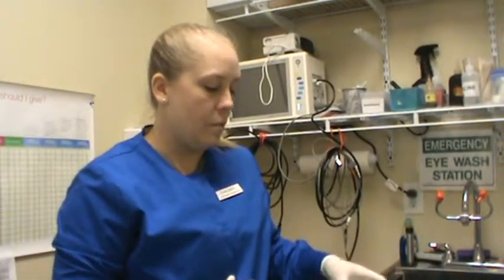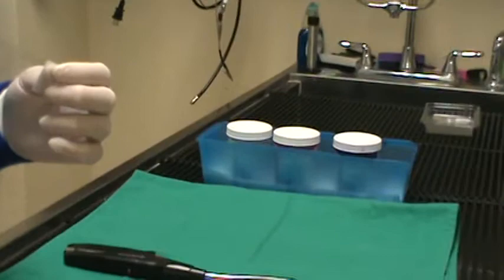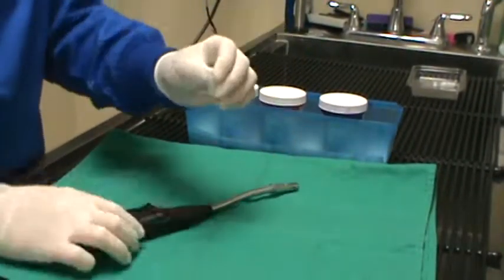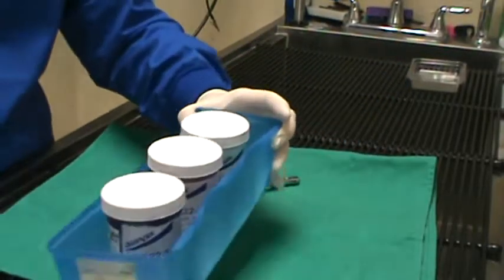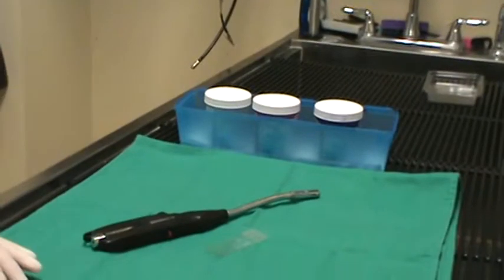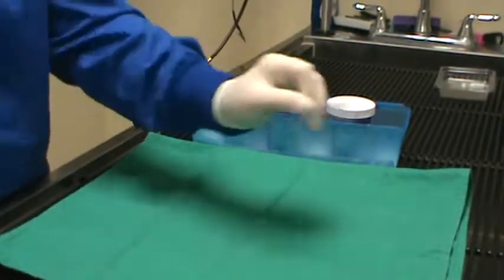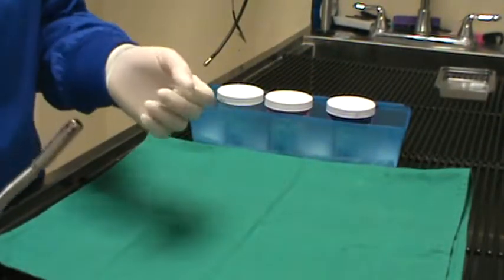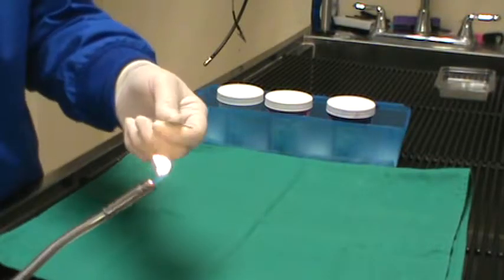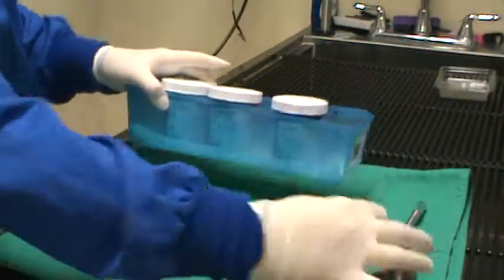This is Chelsea again and we're going to go ahead and film the staining of the ear cytology slide. We have our slide and we have our diff quick stain. We're going to take our sample slide — it's been air drying a little bit — and we're also just going to wave it around in the air. Then we're going to quickly flame it just to get that fixed, and then introduce it into our stain.